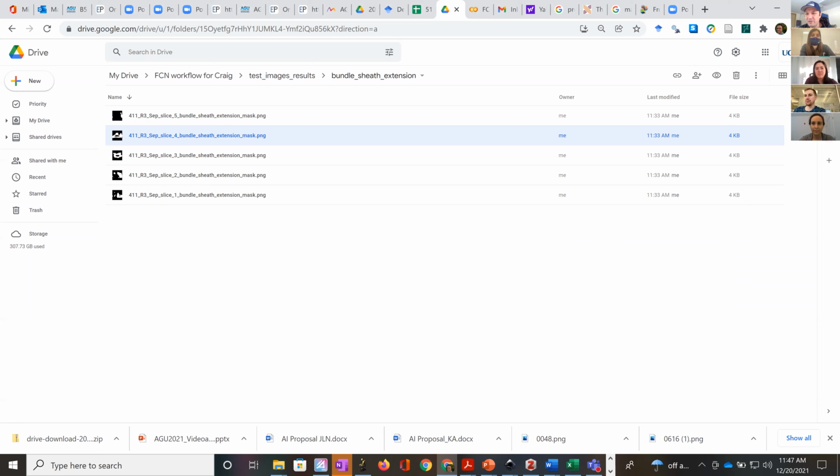Not species, but whatever level is above species. Genus? Genus, yeah, genera. Okay. So of a particular genus, it should be able to segment species from that genus pretty well, especially if the images are the same size. Now, you can train models on variably sized images as well.